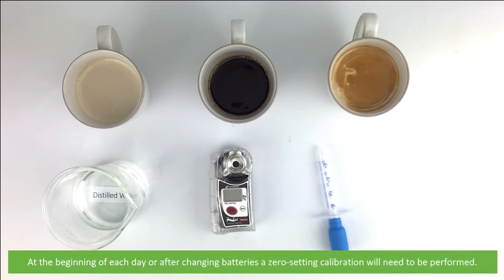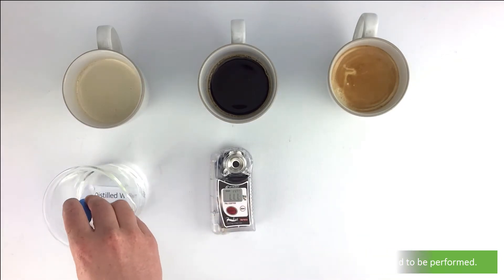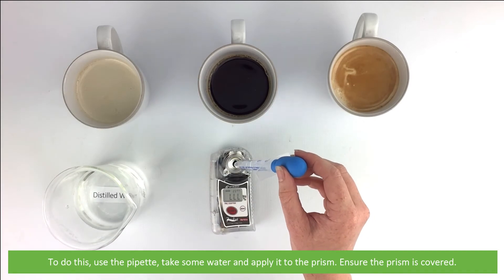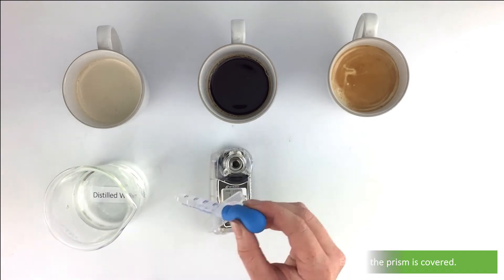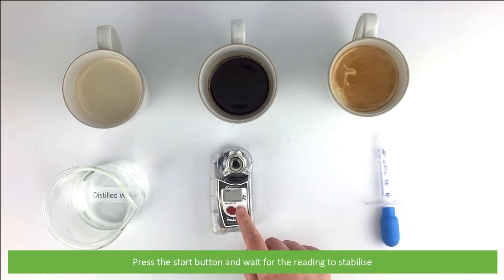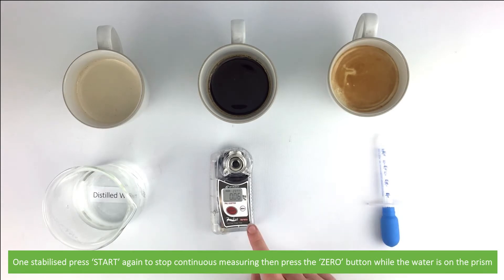At the beginning of each day, or after changing the batteries, a zero setting calibration will need to be performed. To do this, use a pipette, take some water and apply it to the prism. Ensure the prism is covered. Press the start button and wait for the reading to stabilize. Once stabilized, press start again to stop continuous measuring, then press the zero button while the water is on the prism.